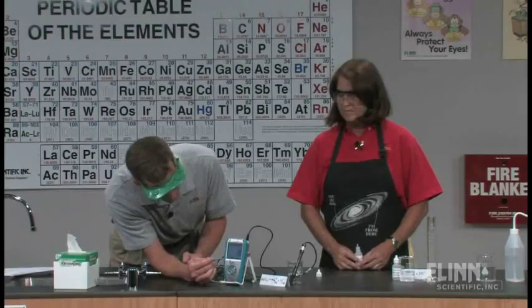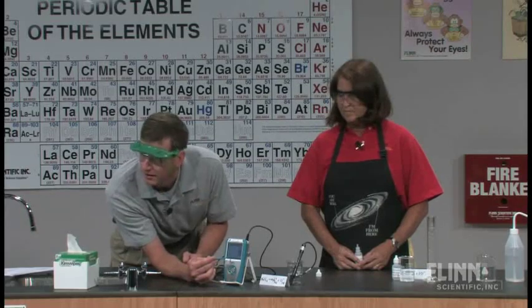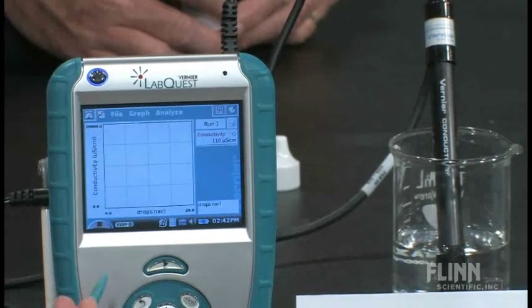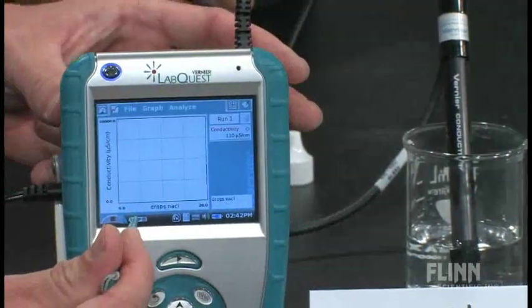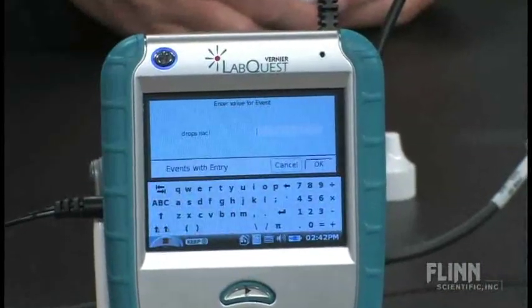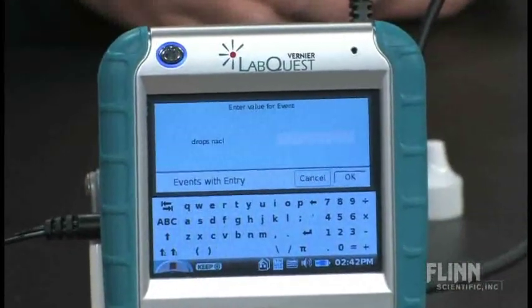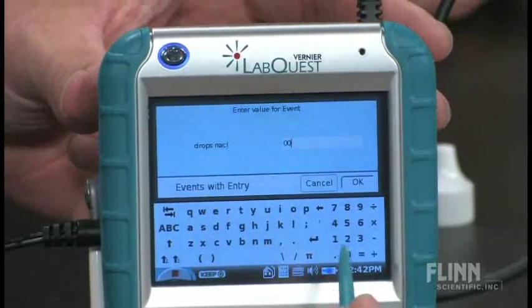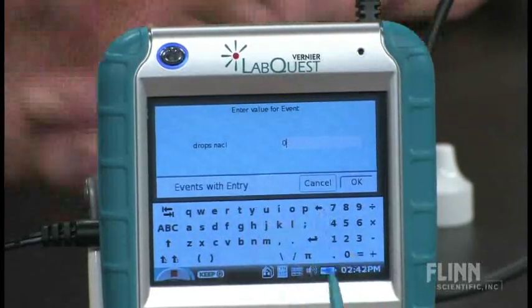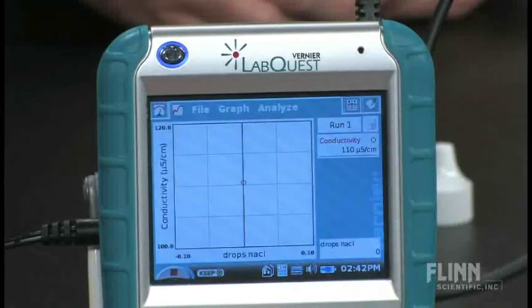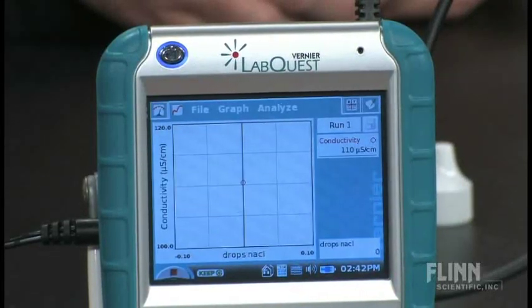As I start the reaction, a keep button comes up here and allows me to keep whatever the probe is reading at this particular point in time. I'm going to press the keep button. That's going to be my zero mark. And if you'll notice, a blank comes up there that allows me to put in that I have put in zero drops of sodium chloride. I can click OK and it gives me my first data point.